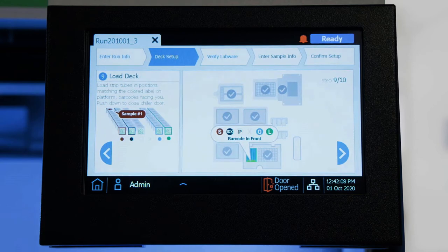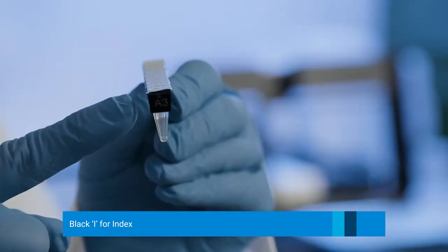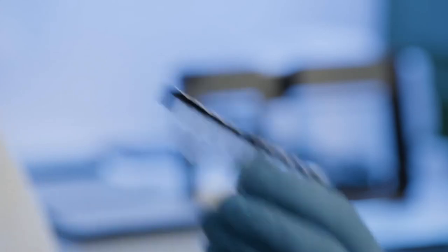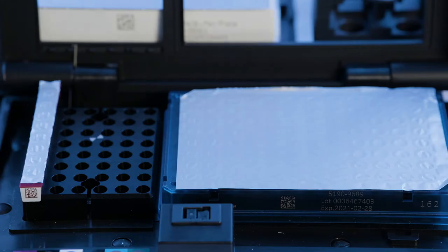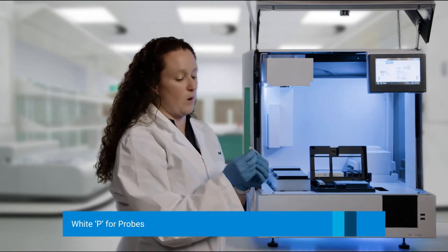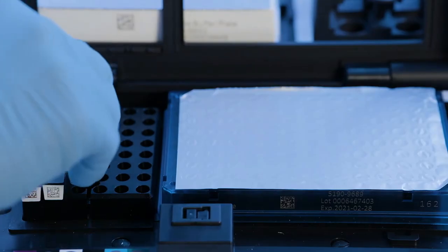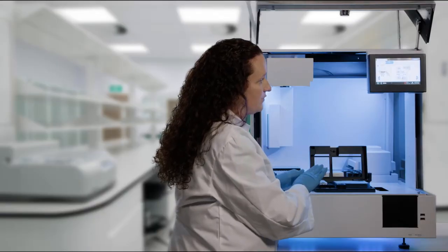The next thing we are going to add is the indexes. The indexes are in a black strip tube. Be sure to note what index you are using — in this case we are using A3, which is very important when you are setting up your sequencer. Barcode faces towards you, and you add that where the Magnus indicates the black strip goes. Next are your probes, located in white strip tubes labeled P. Barcode towards you — place that in the third slot. We will skip the next slot, as nothing is needed for this protocol.